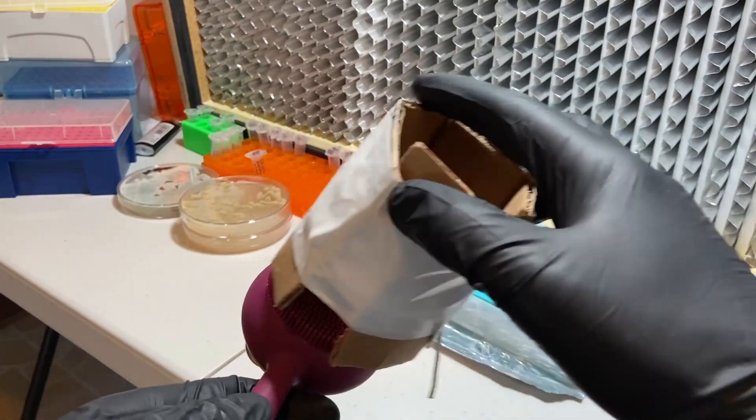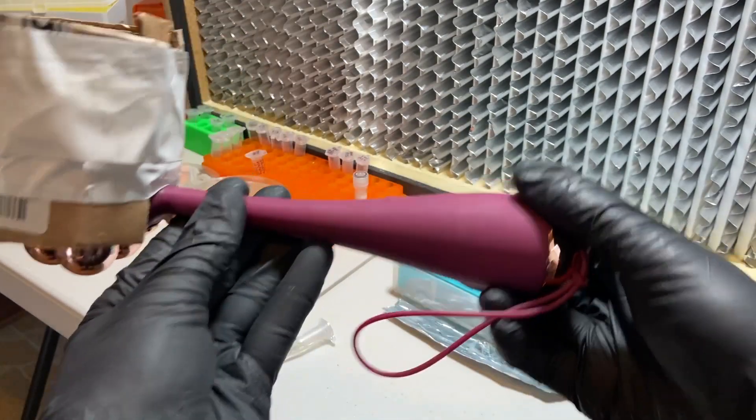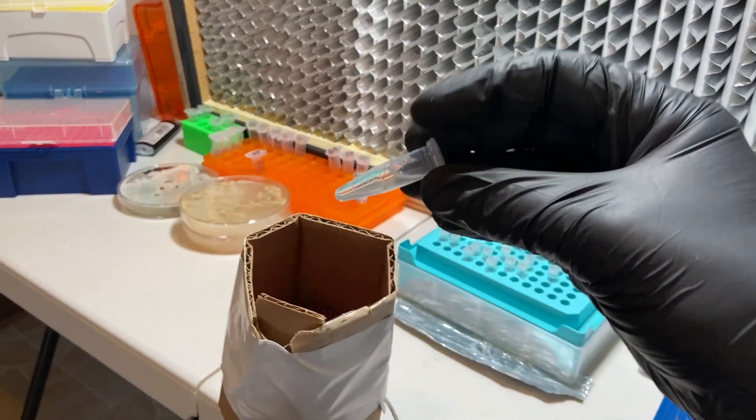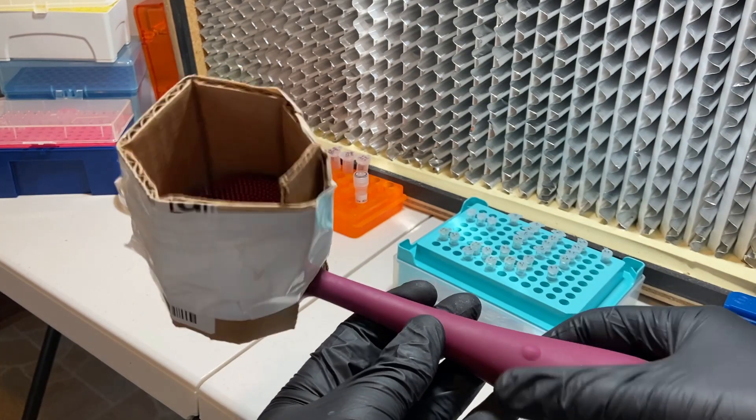All I've done is taken a piece of cardboard and cut out a notch so that I have a place to contain a tube. I put that there, and then I can take a tube — which is what calls for the vortex mixing — place that in here, and turn it on.